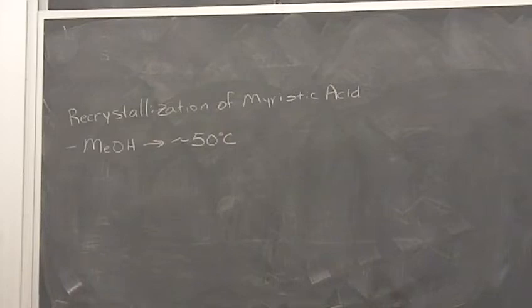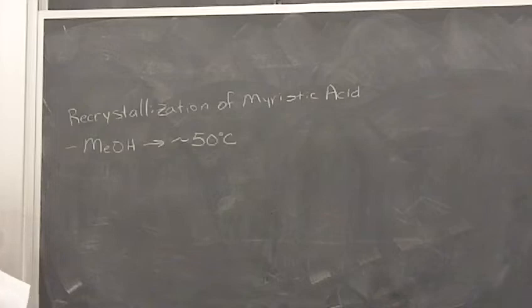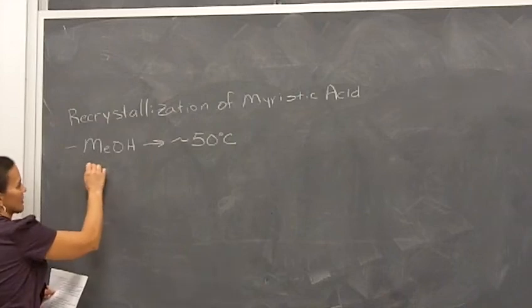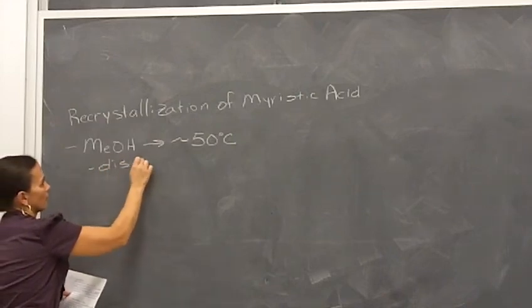So our myristic acid, remember, melts at about 54 degrees. Our trimyristin is going to melt at about 56 degrees. So that's why we've got to keep things at about 50 degrees. So you don't want to be any hotter than 50 degrees, all right? So you're going to heat your methanol to about 50 degrees, and then you're going to add your myristic acid and get that dissolved, okay?